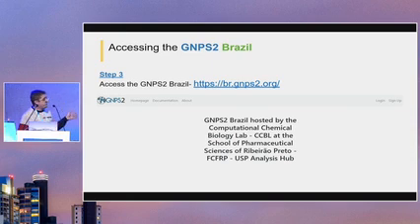This is very interesting for us because it gives us the ability also to know the development of the platform closer. So if any of you have an idea for a tool or an app, all this code is available on GitHub of the main developer, that is Ming Wang at Riverside University, as Lurian mentioned. So you can go there and see how these workflows are being developed. If you and your group of collaborators have your own idea for a workflow, you are welcome to try it and maybe connect to Ming to contribute.